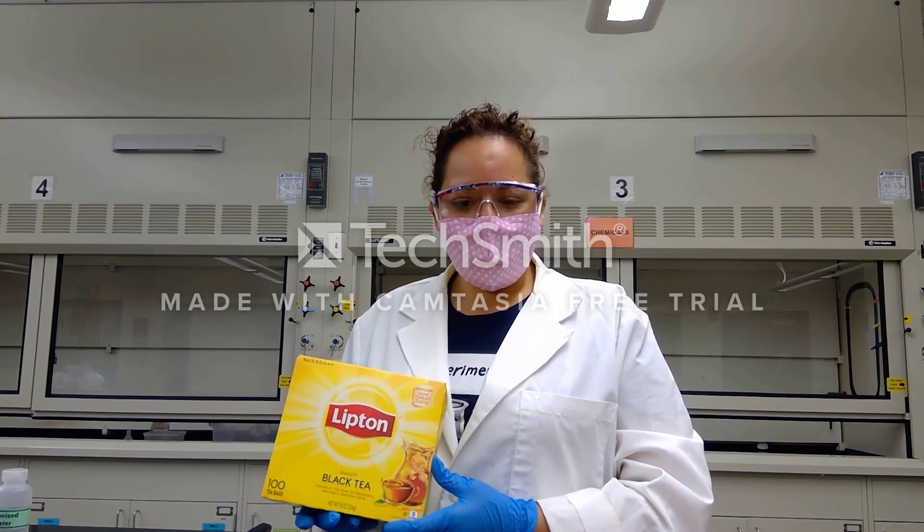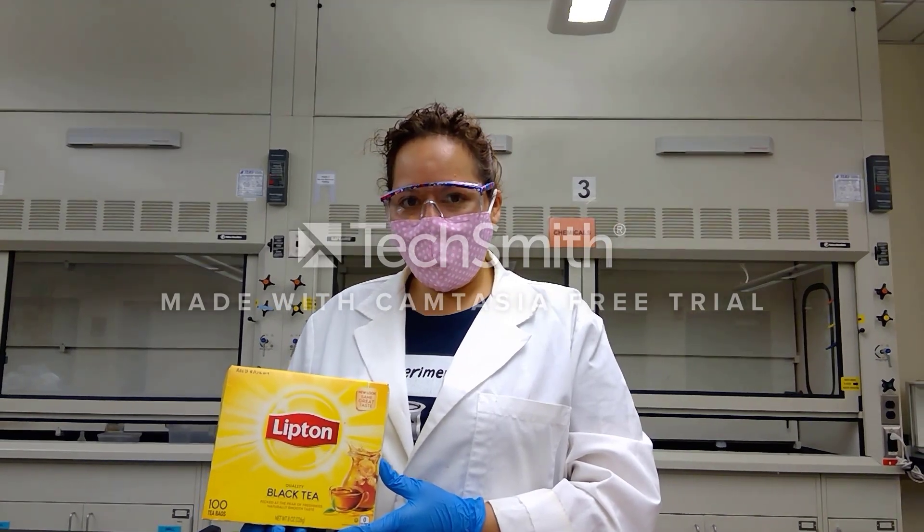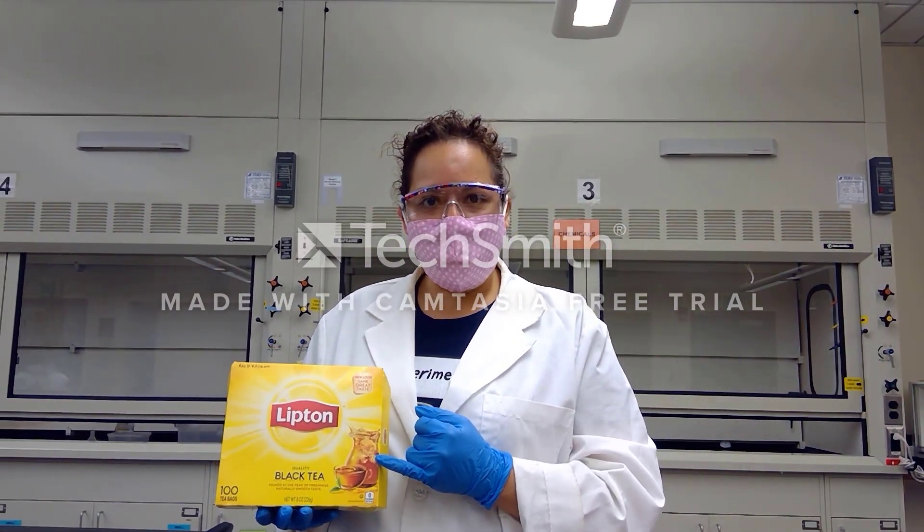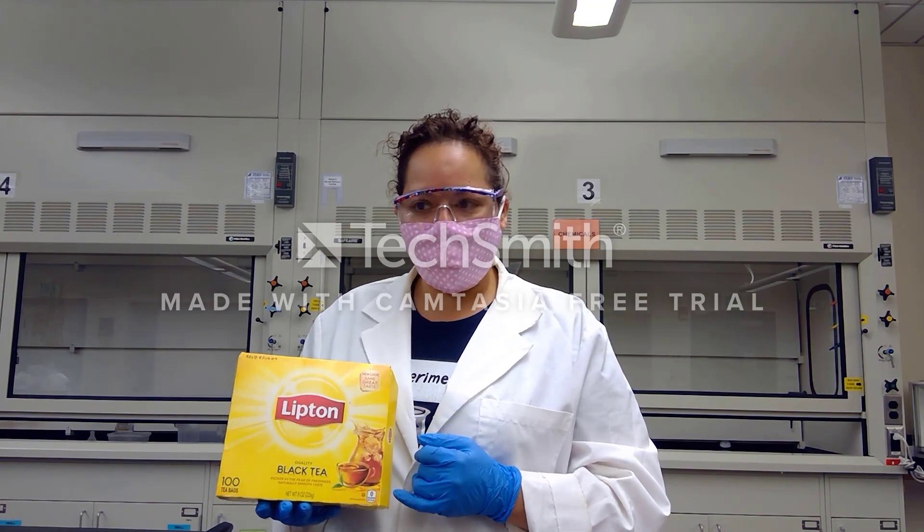Hello students, today we're taking a look at the isolation of caffeine from tea. We will be using regular Lipton black tea in order to extract the caffeine from it.